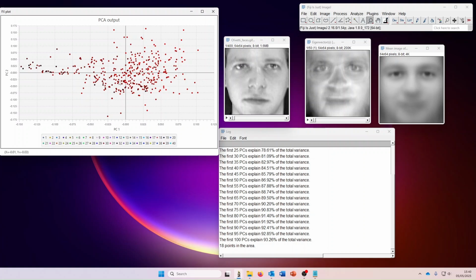Now, this is probably more meaningful when you're processing other modalities of data, right? For instance, if you're processing gene array data, where you have tens of thousands of genes, you could then recolor the PCA or the t-SNE or the UMAP plot by a single gene's value across the whole data set.